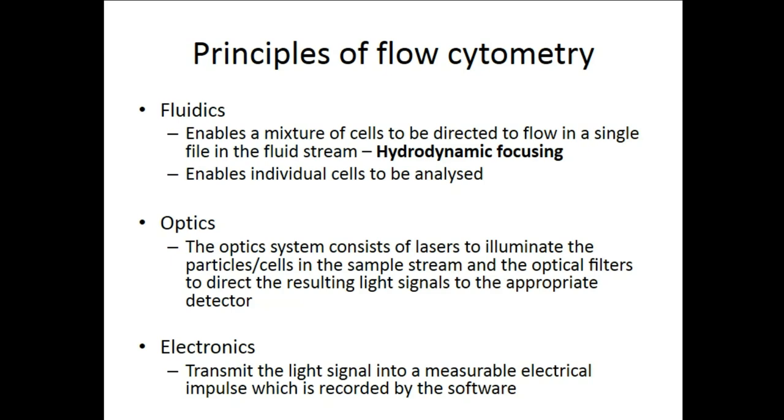So when you're answering this particular question in the practical, you'll get a mark for saying hydrodynamic focusing. Of course, you don't just state hydrodynamic focusing. I would want to say that you understand it. Okay?